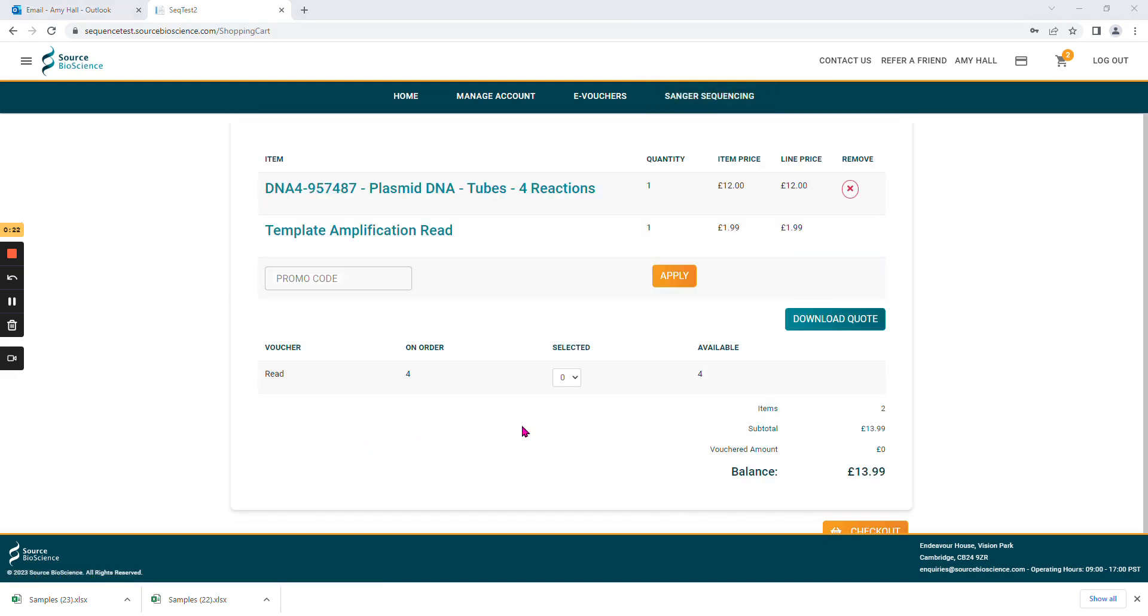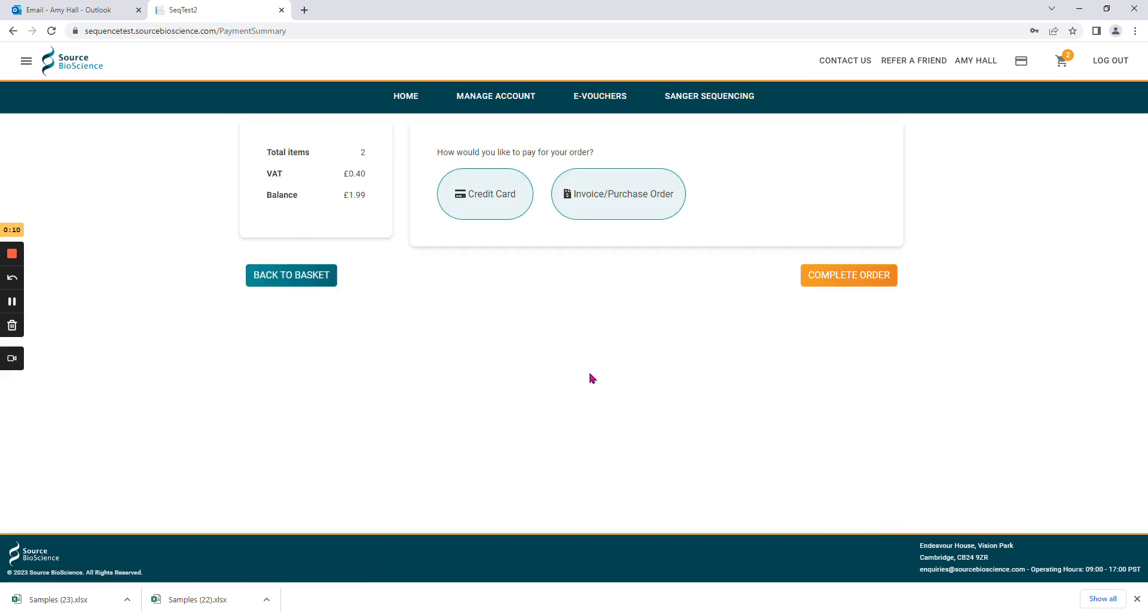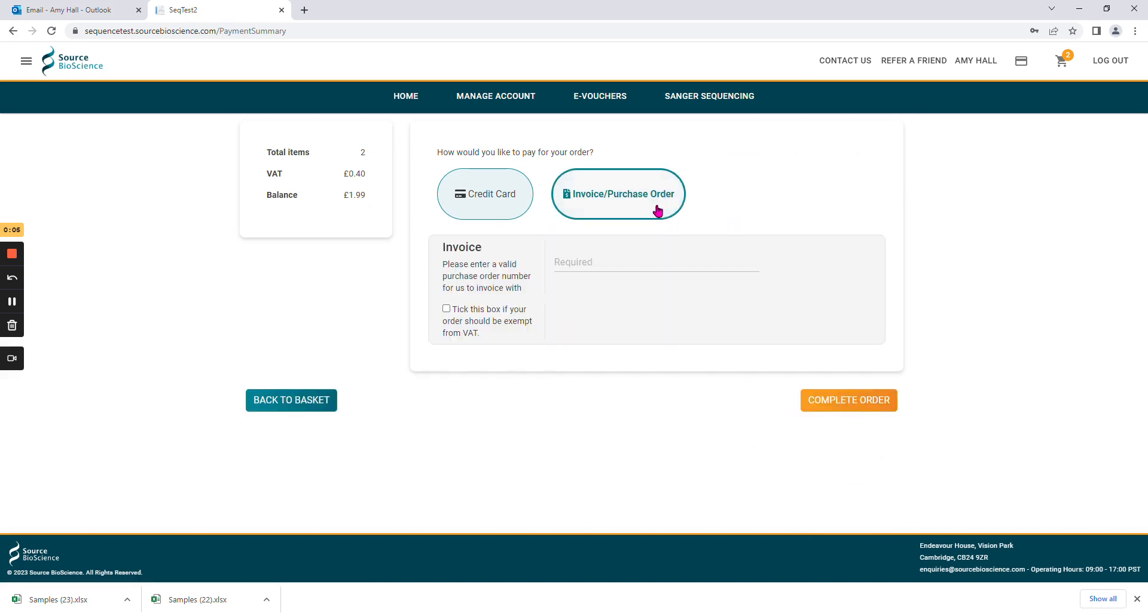If you have e-vouchers available to use, they will show in this drop-down list here. You can select how many you wish to use, and it will update your balance. If you have a remaining balance to pay, you can select checkout, and then choose to pay via credit card, PO, or spend down if that's available to you.